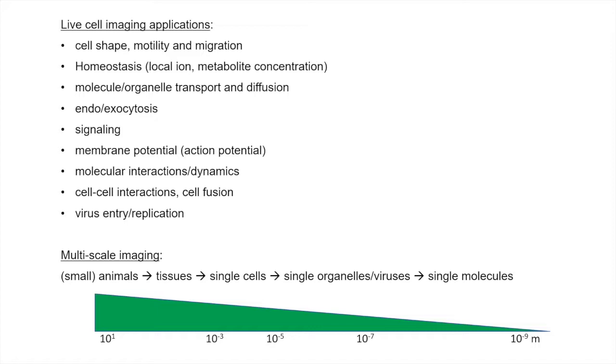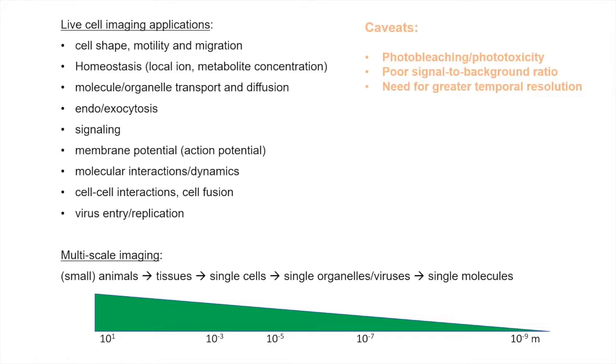So there are wonderful advantages for live cell imaging. However, there are also limitations. Cells are not used to being exposed to direct sunshine, and to extract enough signal from fluorophores, they are ordinarily exposed to excitation light many times over the sunlight. That leads to phototoxicity and photobleaching, which is a major limitation.